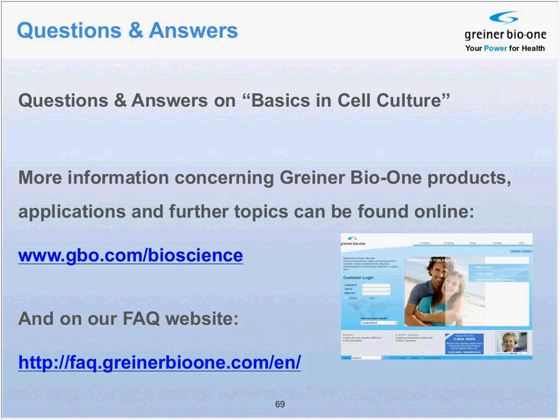Also, you might actually have special requirements with regard to the production in the bioreactor. Basically, it depends a little on the bioreactor you're using. If the cells are happy in the bioreactor, then obviously you don't need to change the medium. However, it could be the case that you need to add something to lower the stress due to the stirring.